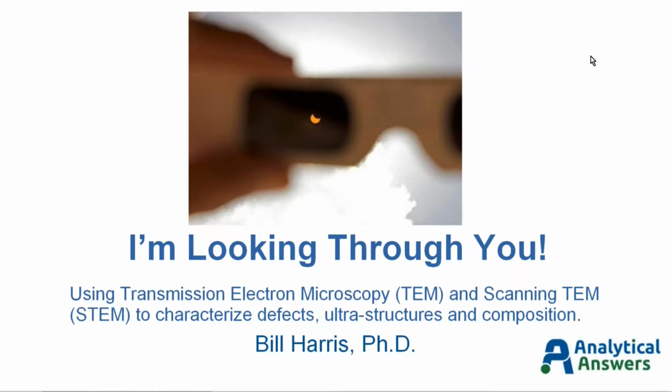Okay, thank you very much, Christina. Well, welcome to today's webinar. I'm going to spend the next few minutes, as Christina said, giving you an introduction to transmission electron microscopy and scanning transmission electron microscopy.